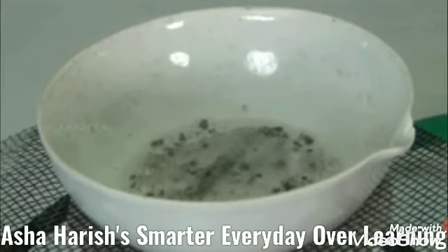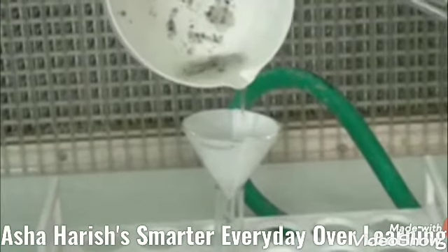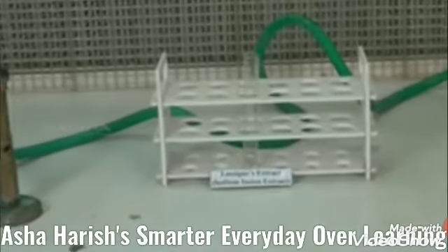Okay, you are seeing on the screen, this is the cooling process. Then now we have to filter the complete solution into a beaker. Okay, now you have to get the Lassaigne extract.